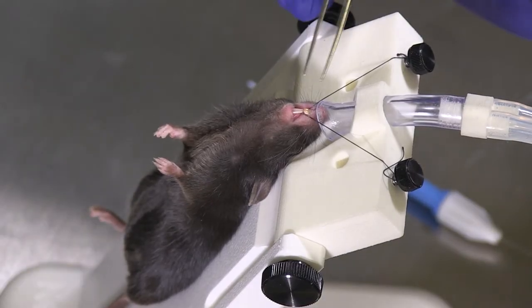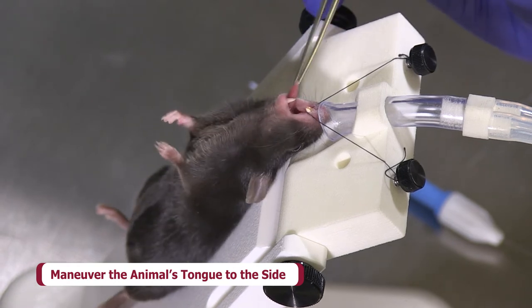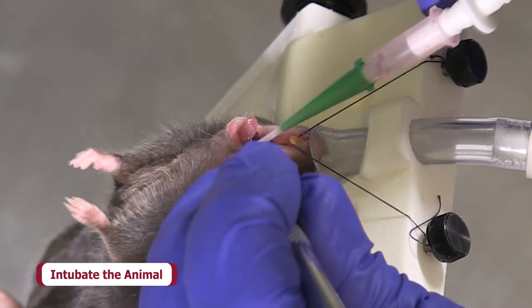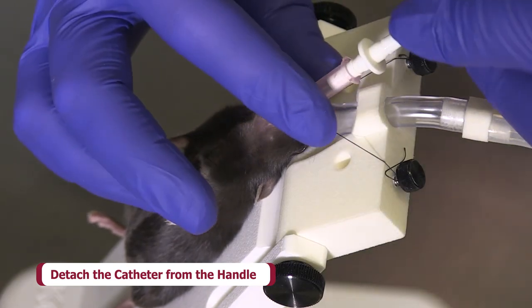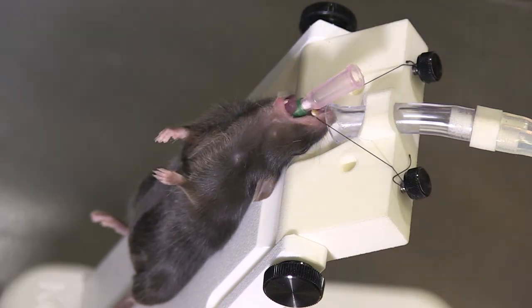Using the included small spatula, maneuver the animal's tongue to the side until the tracheal opening can be visualized. Intubate the animal using the fiber optic as a guide. Insert the fiber optic cable until you lose visualization of the fiber optic guide. Gently detach the catheter from the handle using the thumb and forefinger of one hand while the other hand supports the animal to maintain the catheter's position in the trachea.